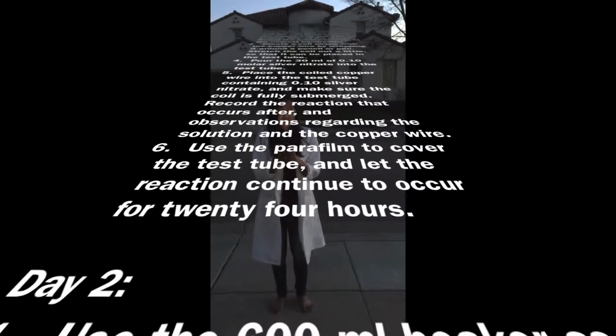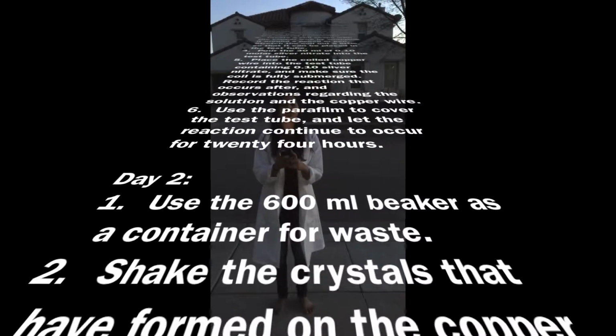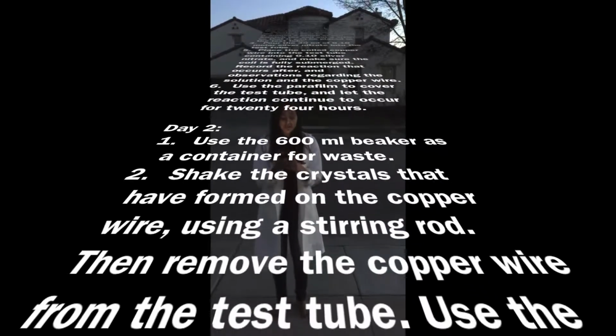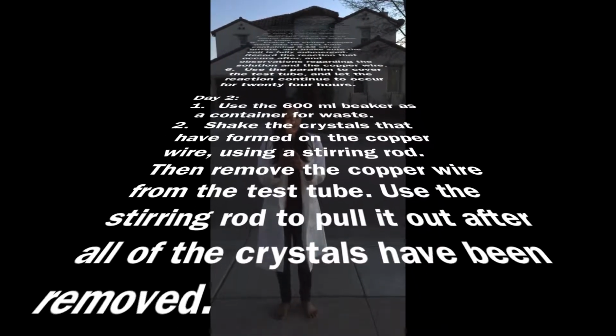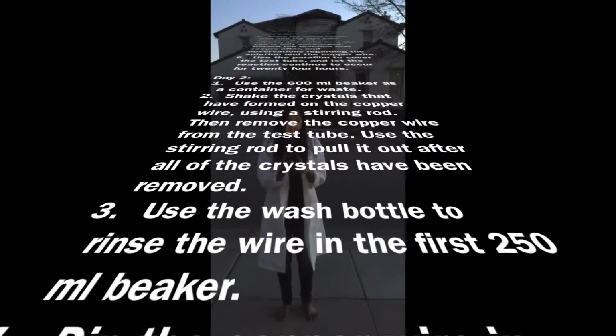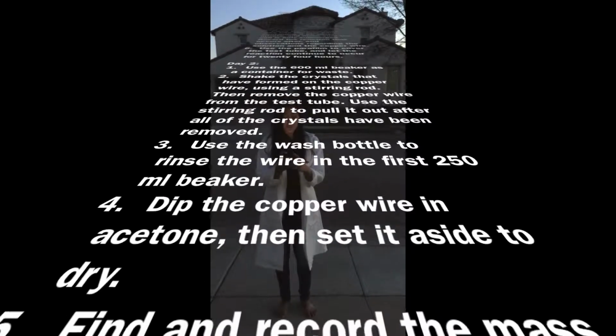Step 6. Use the parafilm to cover the test tube and let the reaction continue to occur for 24 hours. Day 2. Step 1. Use the 600 milliliter beaker as a container for waste. Step 2. Shake the crystals that have formed on the copper wire using a stirring rod. Then, remove the copper wire from the test tube. You can use the stirring rod to pull it out after all the crystals have been removed.